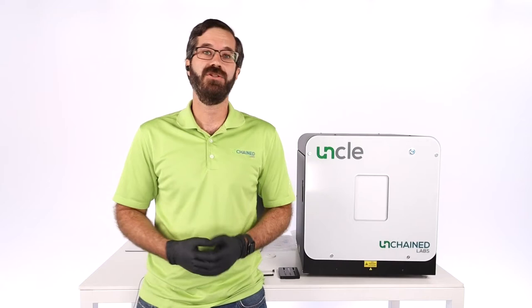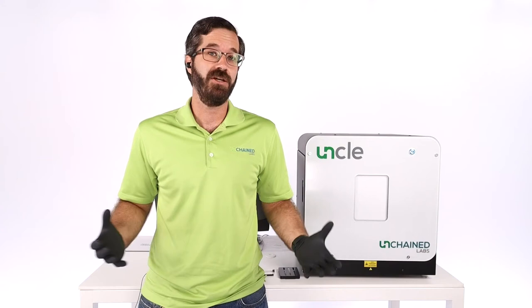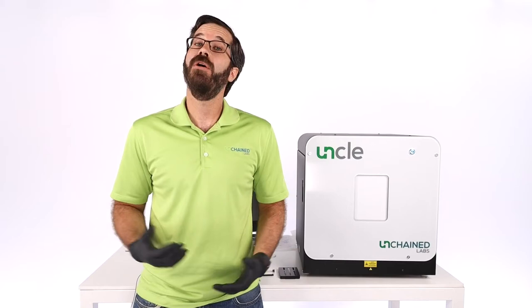So this is UNCLE. UNCLE is an all-in-one thermal stability platform that has temperature control inside of it and three different detection modes that we are going to be using in combination with each other to take a look at a single monoclonal antibody in four different buffers in order to rank their thermal stability. We're going to be looking at both conformational thermal stability — the unfolding of the protein — and the colloidal stability of the protein, looking at when aggregation happens.